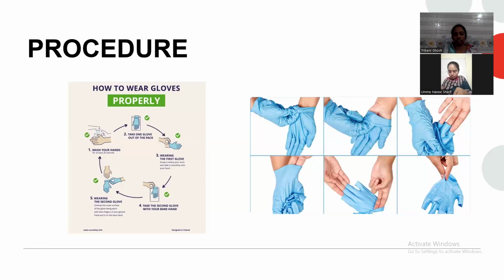Just make sure all your fingers are in the right position. Yes, just give me a second. Can you show me again? Like your thumb in the thumb position, your middle finger in the middle, your ring finger in the ring position, just like this. Okay. Now I think I can do it. Take some time.